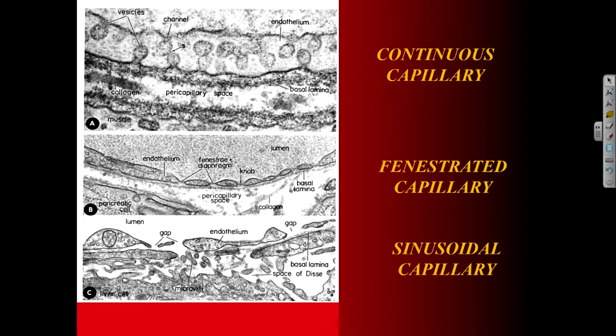The diaphragm is a membrane. The fenestration is the hole, and across that hole is a membrane which we call the diaphragm. It's a membrane that covers the hole, so no cell is going to pass through there. It's only fluids and very small molecules. Nothing is going to get through there easily. It spans the hole. You can see it here. It goes from one end of the endothelium to the other. That's the diaphragm right there. Here's another one right there. It's basically a little bit thinner than a plasma membrane, almost like a plasma membrane covers that hole. Very thin sheet. Okay, another question?